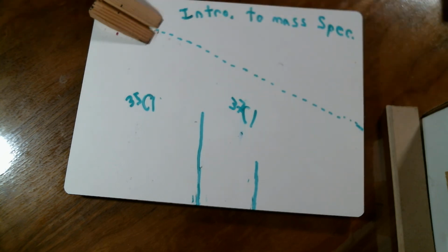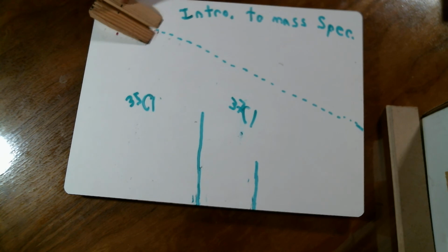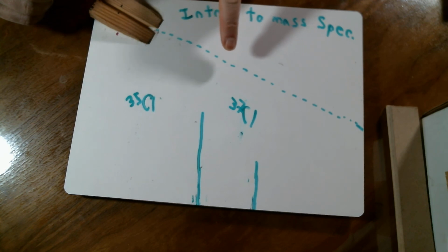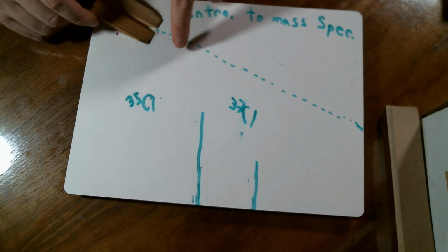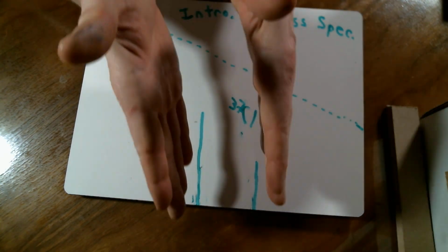And in a mass spectroscopy machine, you would ionize all of the atoms, or as many of the atoms as you could, that you were going to run through the machine, so it would be affected by a magnet. So the first step, ionization. Second step is we have to accelerate it, so more or less using this ramp to start running it by the magnet. Okay? So step 1, ionization. Step 2, acceleration. Step 3 is deviation. In other words, the deviation is going to be that magnet that's underneath this board that's going to cause the paths to shift.